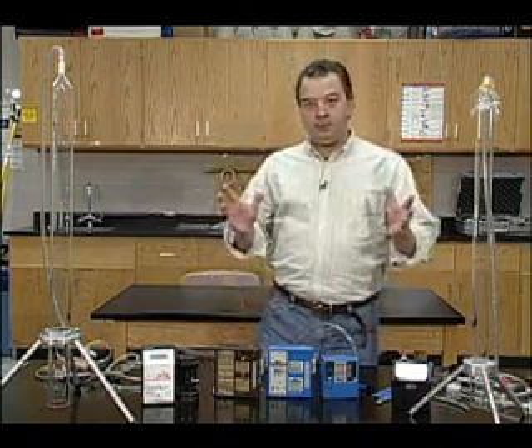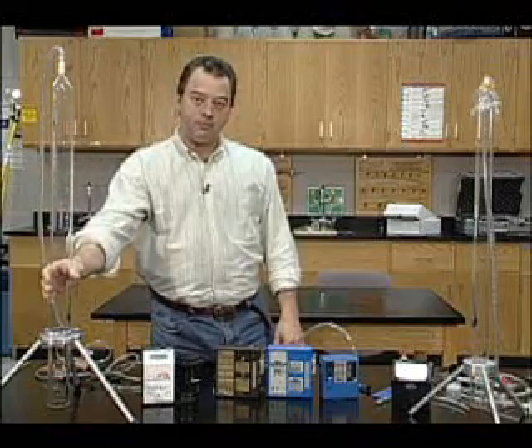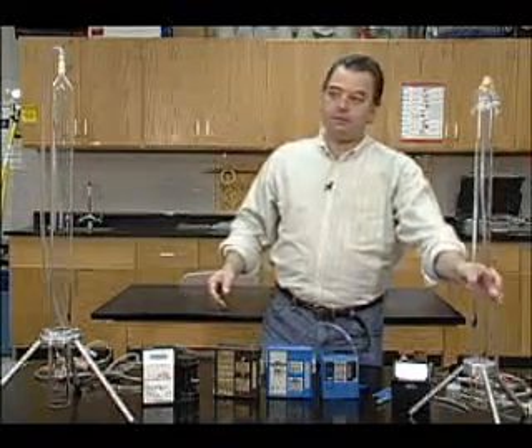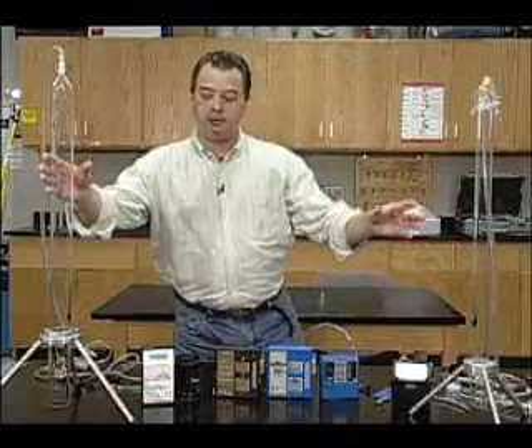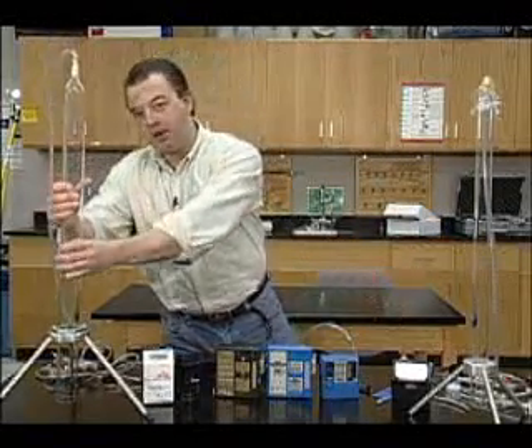First, let me talk a little bit about the calibrators. The first ones being bubble tubes — this is a one liter, and this is a half a liter. These never need to be calibrated or adjusted. It's a known volume and shape; it can never change.